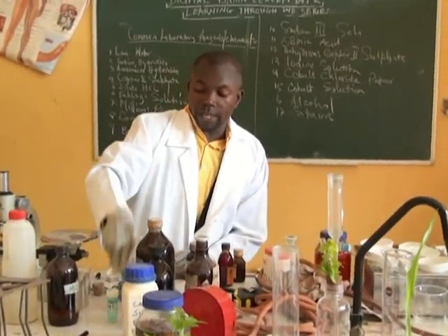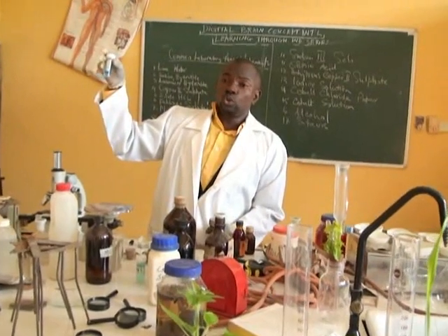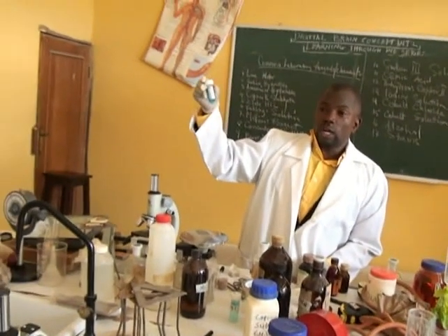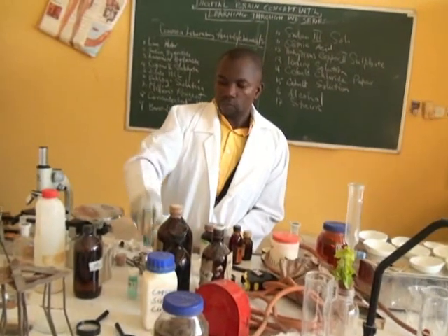Then we also have Benedict's solution, which is also used for confirmation of the presence of simple reducing sugar. So we use it to test for sugar, glucose.